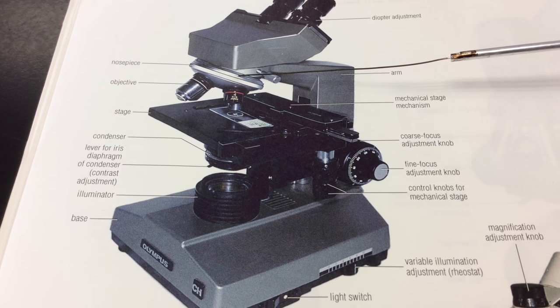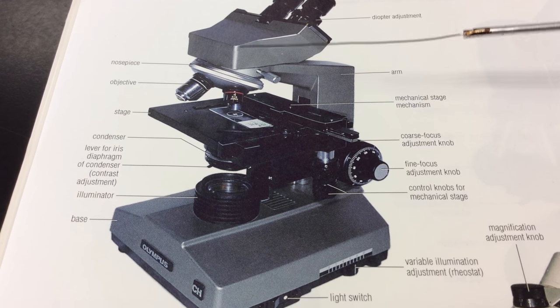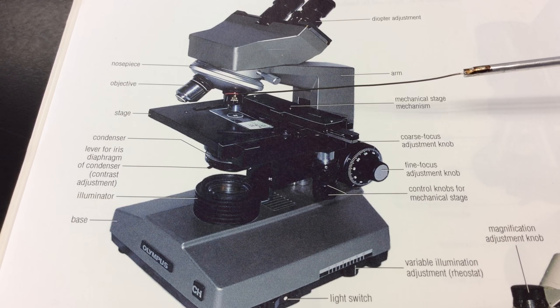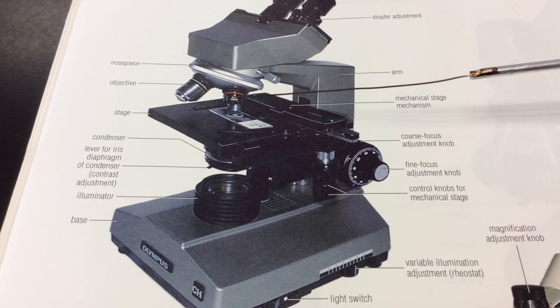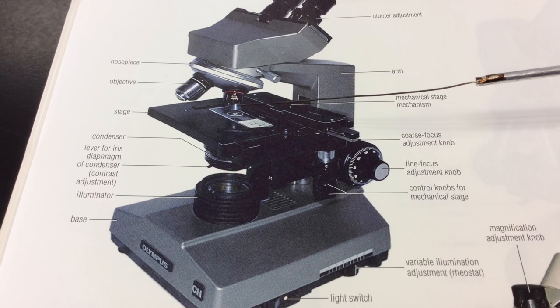And it's on this rotating nose piece or turret that we'll have our four different objective lenses. The shorter the lens, the lower the magnifying ability. So here we can just make out this is the 4x, the scanning lens. And then as magnifying power increases, the lens is going to get longer and longer.